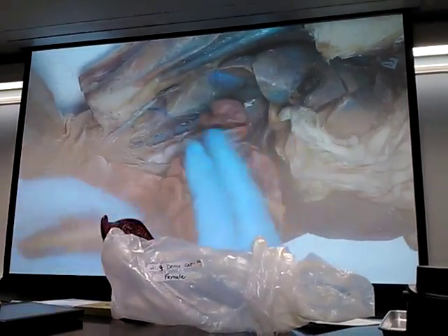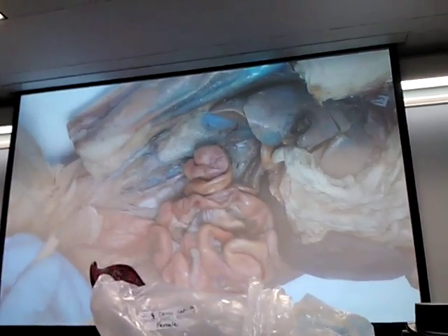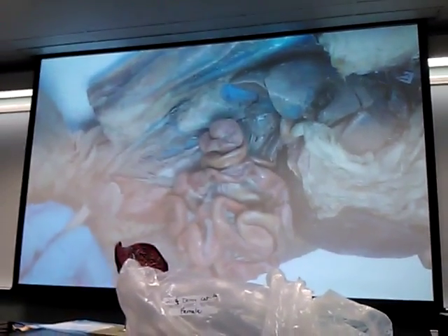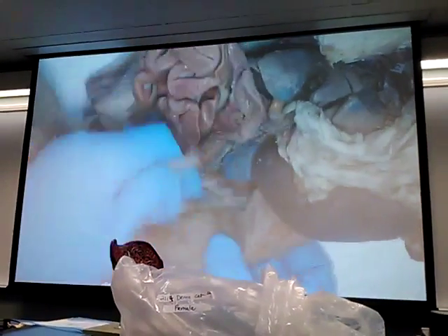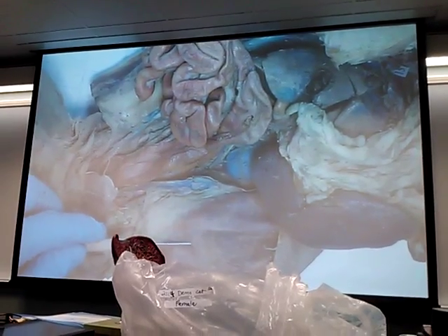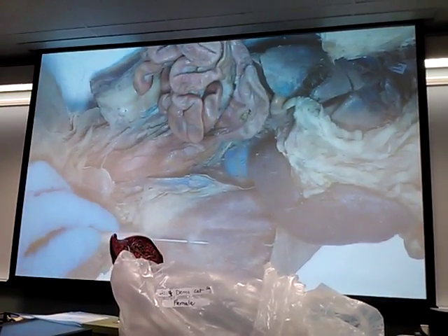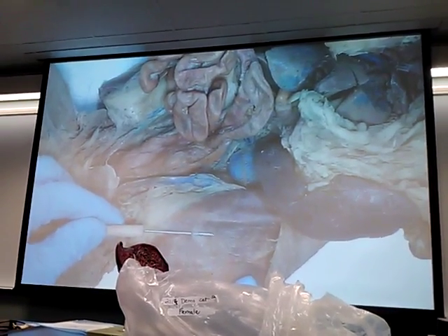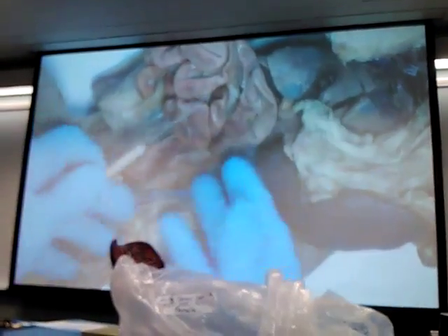It's a thin membrane right on the surface of all those organs, because viscera means organ, right? Visceral peritoneum. And then for parietal peritoneum, I would just go on the inside wall of that abdominal pelvic cavity, go through the membrane of that wall, parietal peritoneum. And then peritoneal cavity, and just drop the pin in there.